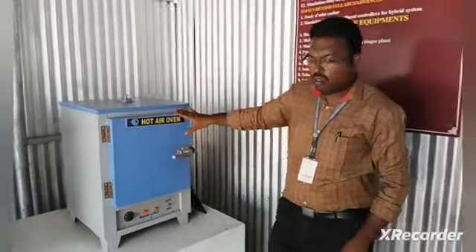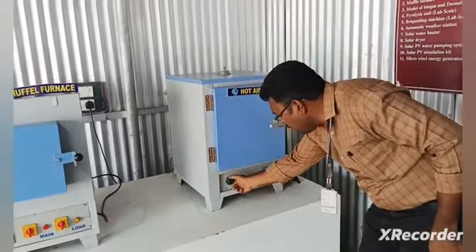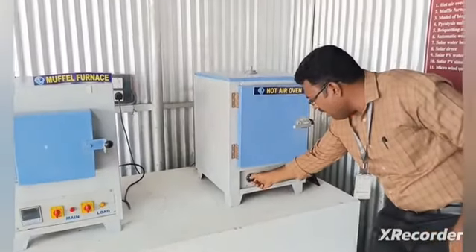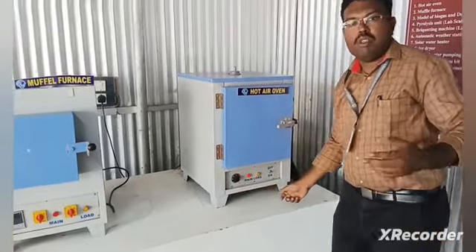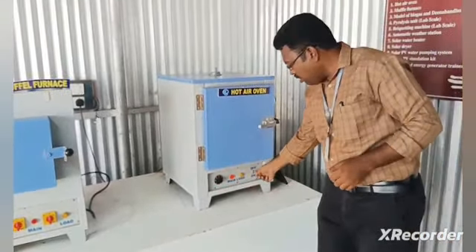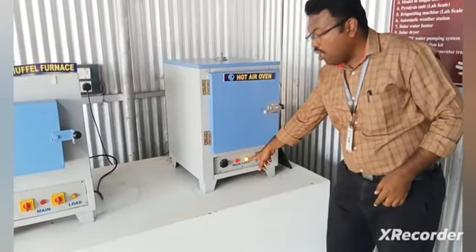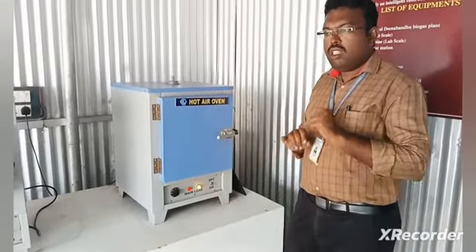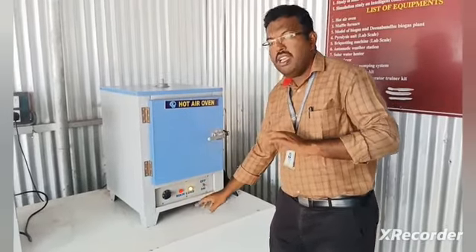After ensuring the door is closed, we set the temperature. The minimum is 50 degrees Celsius and the maximum is 300 degrees Celsius. We can fix the temperature for the required value for the biomass material. Once we have checked the material, we switch it on. Once you switch on, we get the load indication, which means the biomass material is heating. Once it reaches the set temperature, the load condition automatically shuts down.